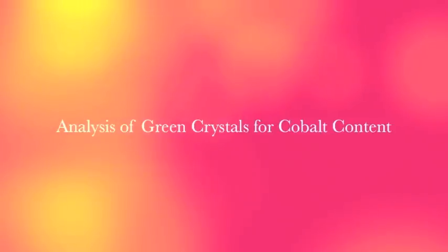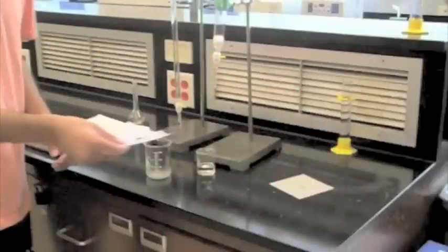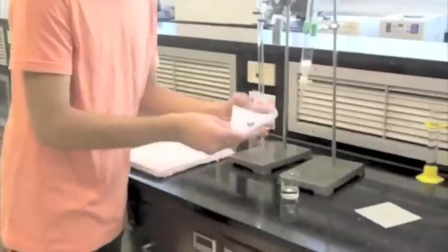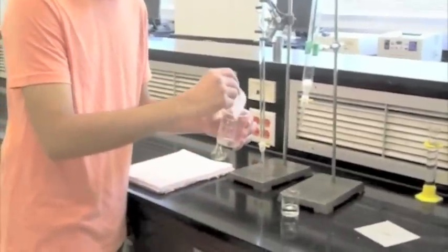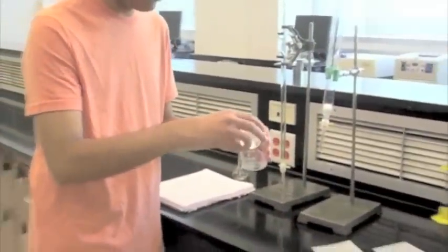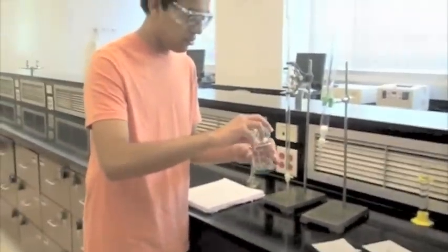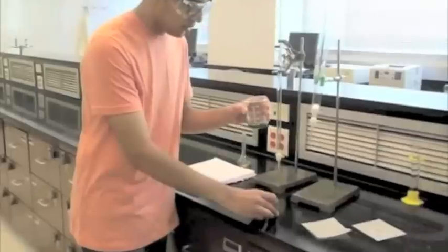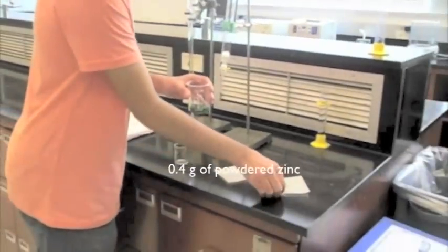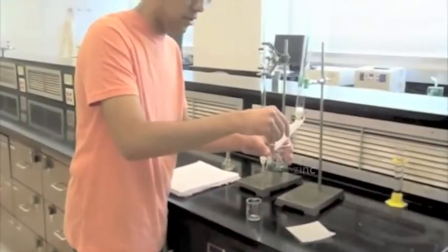Starting with the first step: reduction. You need to have roughly 0.7 to 0.8 grams of green crystals and add it with 20 milliliters of deionized water. Then pour in 0.4 grams of zinc in the beaker and swirl the solution for several minutes. Notice how the color changes from a murky green to dark red.